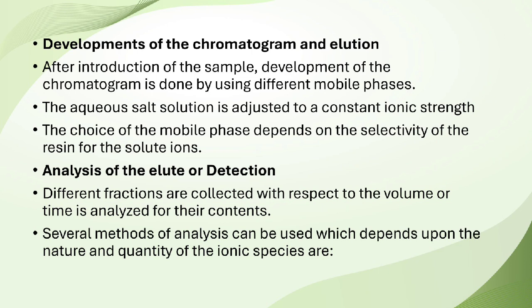Development of chromatogram and elution. After the introduction of sample, development of the chromatogram is done by using different mobile phases. The aqueous salt solution is adjusted to the constant ionic strength. The choice of the mobile phase depends on the selectivity of the resins for the solute ions.